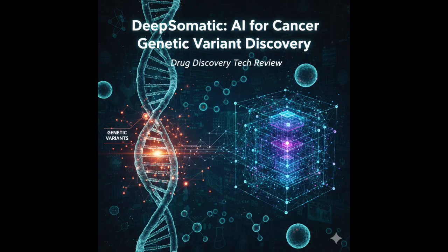So the CNN learns to look at a variant in the tumor reads and ask, does this pattern look like something commonly seen in the panel of normals or population databases? Exactly. If it matches a common germline variant signature from the PON or databases, the model learns to filter it out, assuming it's likely inherited, not somatic. It's not as precise as having the patient's own matched normal, but it's a very clever workaround.